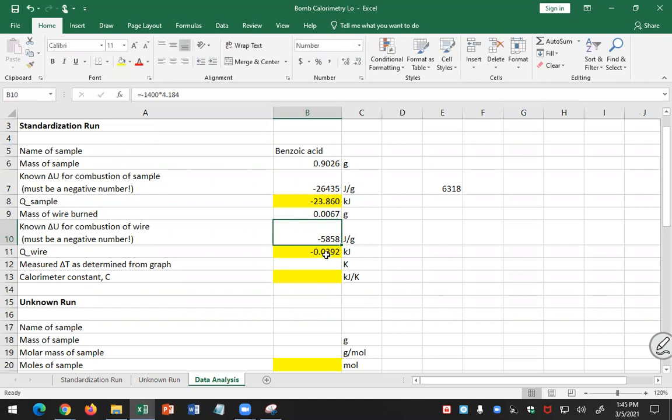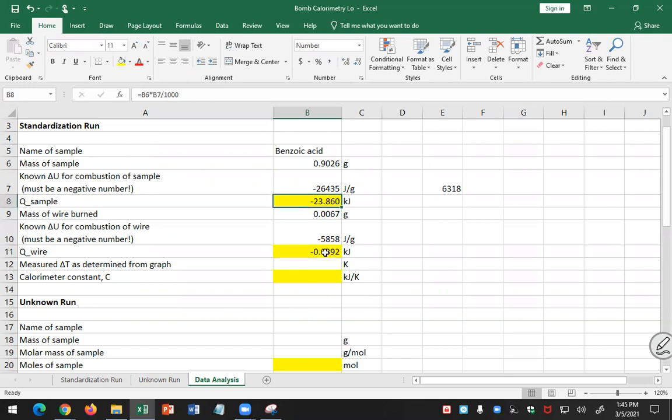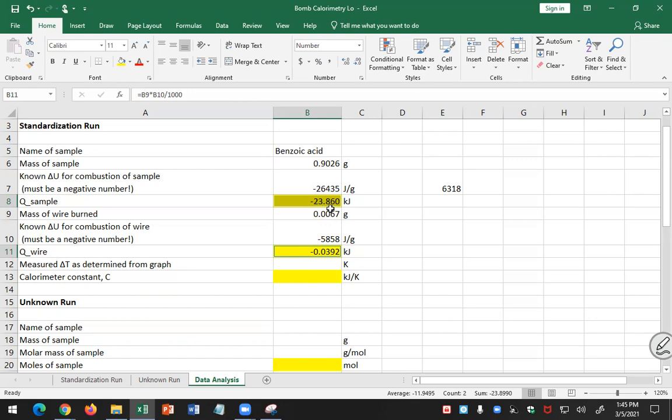So you can see, of the total heat released by the sample and the wire, compare the wire and the sample. That's a small correction from the wire, 0.04 versus 23.86. Most of the heat that's released by the reaction is from the sample, not from the wire, as expected.